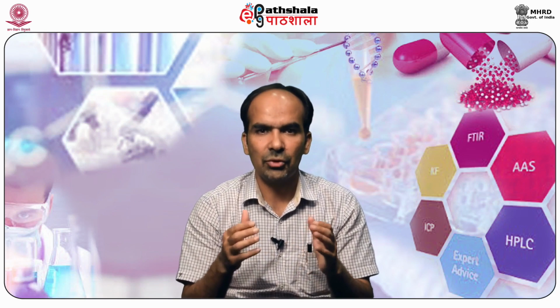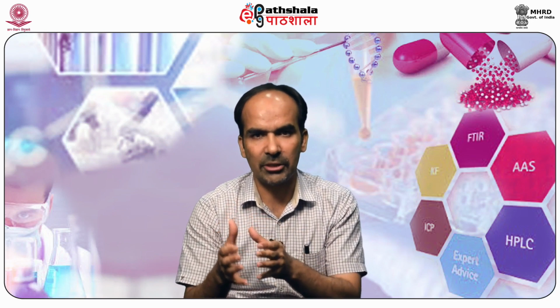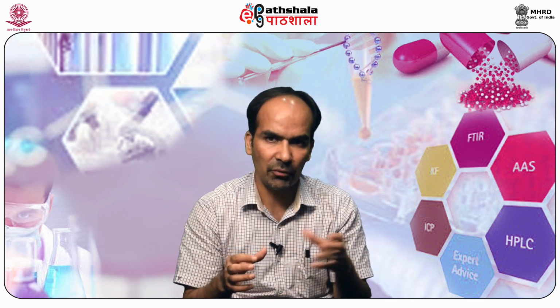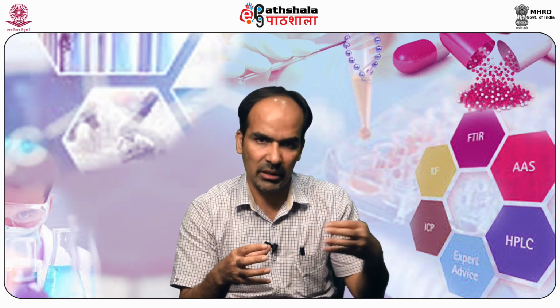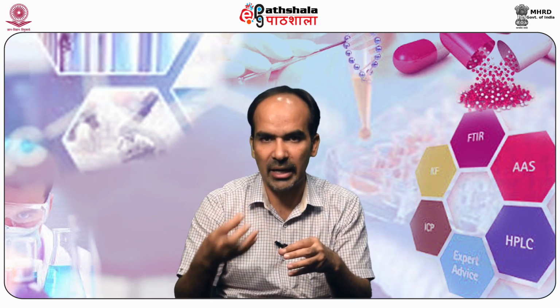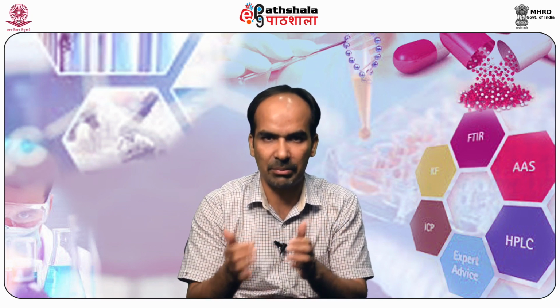Now we should understand that the analysis with spectroscopic methods may need a preliminary sample preparation step. It can be a simple purification step so that the active constituents are separated, or the substance that is to be identified and analyzed needs to be separated. So that may need a preliminary sample preparation step.